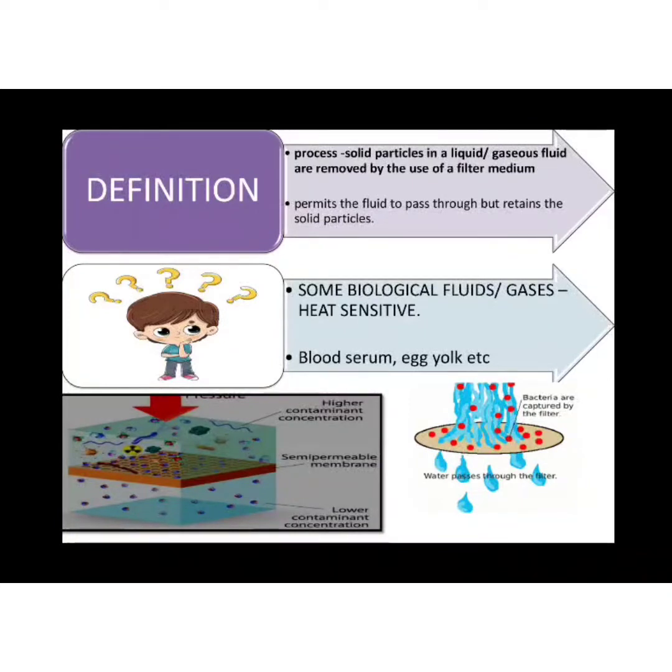Which are some of those ingredients? For example, blood, serum, egg yolk, etc. These are some of the ingredients I will be adding to the medium. Now these components definitely cannot withstand high temperature. In such cases I will use filtration as a process of sterilization.